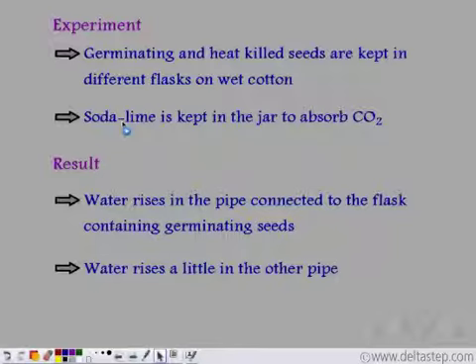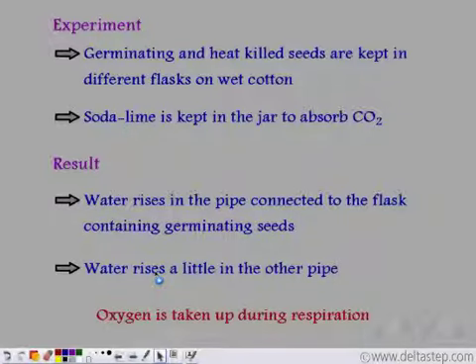But it did not rise much because the oxygen was not taken up. So from here, it is proved that oxygen is taken up during respiration.